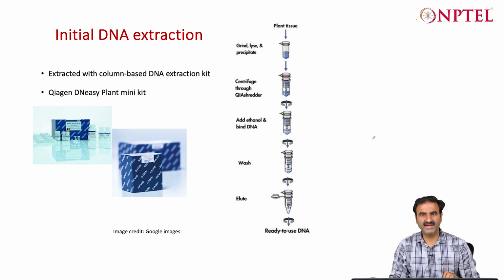Okay, so first of all the DNA has to be extracted, for which there is a conventional method, okay, which you should be having a molecular biology team that is doing this all the time, or there are some DNA extraction kits available where the protocol is defined and you just follow the steps and try to get the DNA. Or you can always optimize the steps, okay, such as incubation period, because you have to break open the cell, and get the nucleus or without nucleus, and RNase treatment, proteinase treatment. So all these things basically you have to optimize.